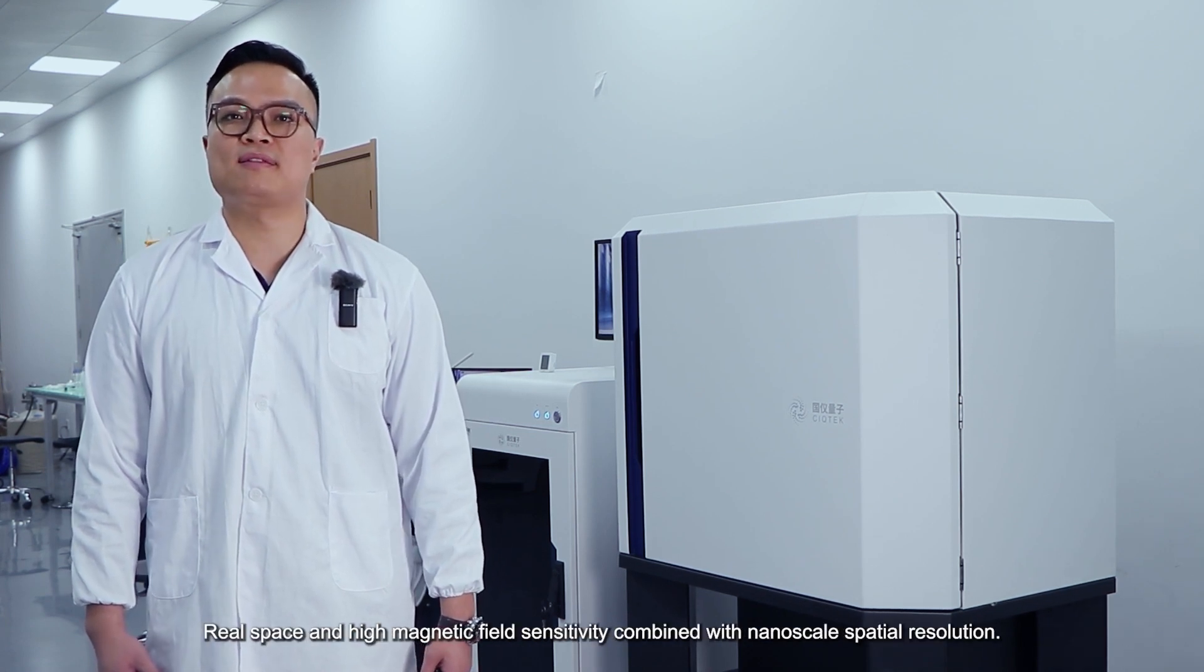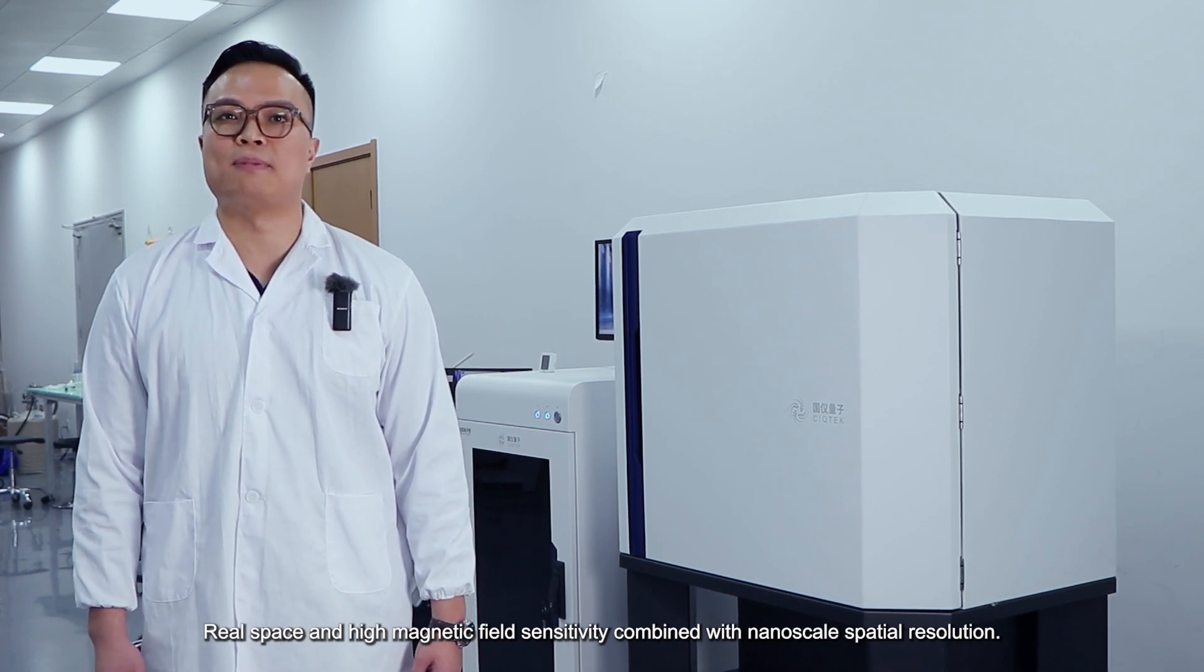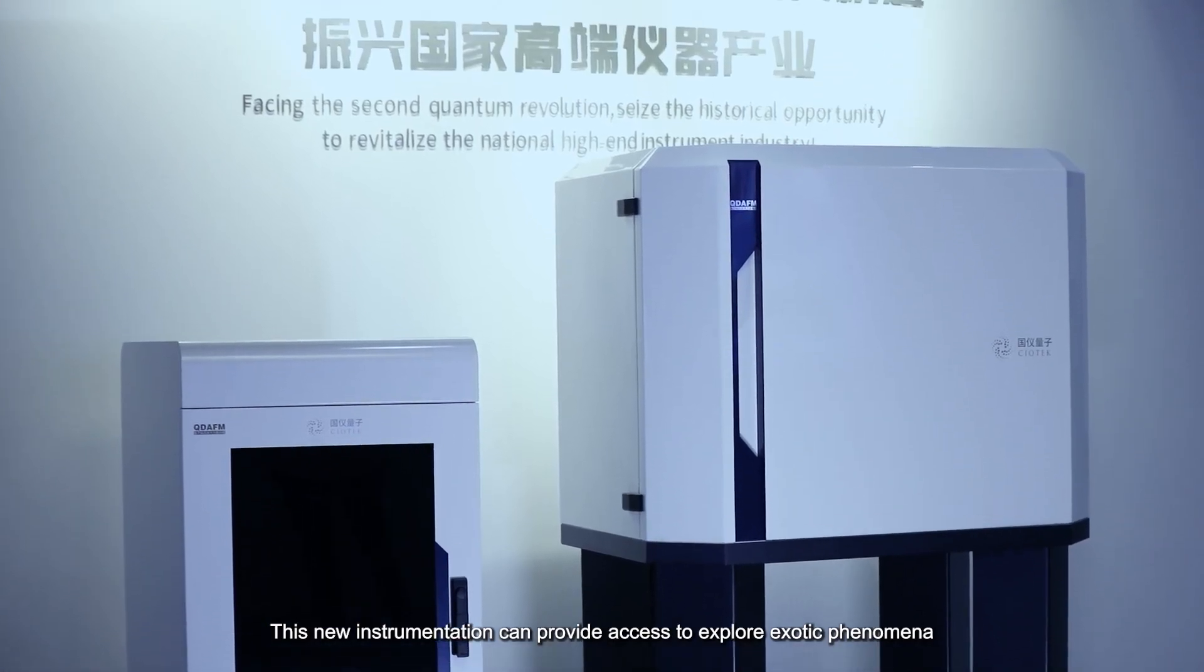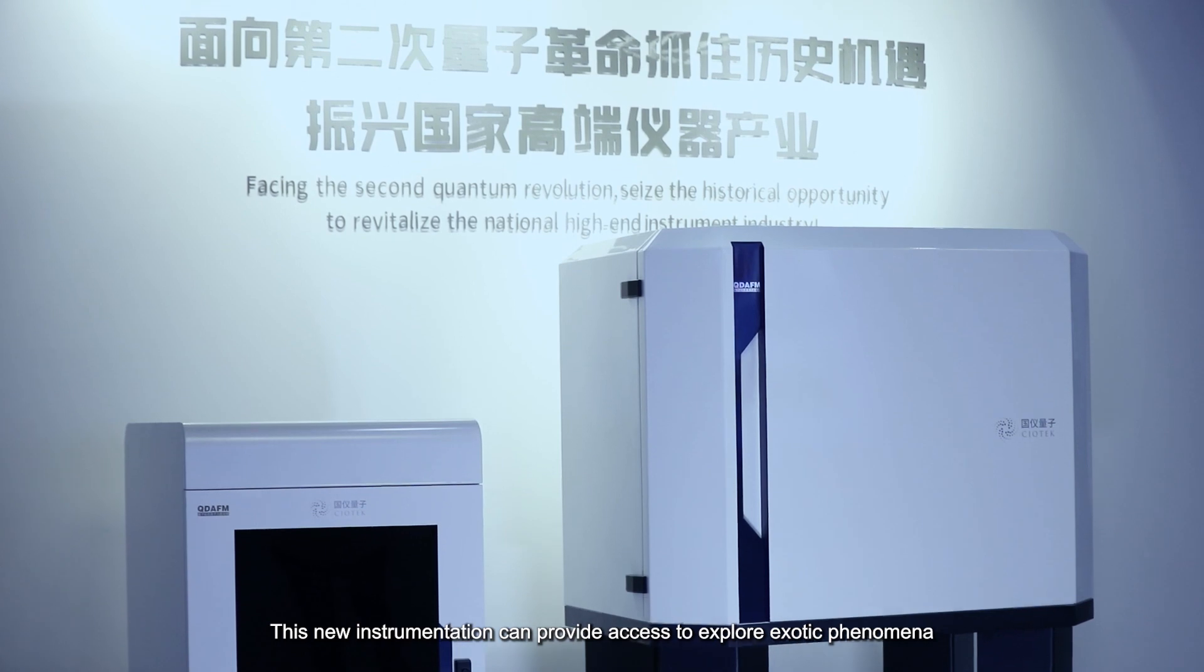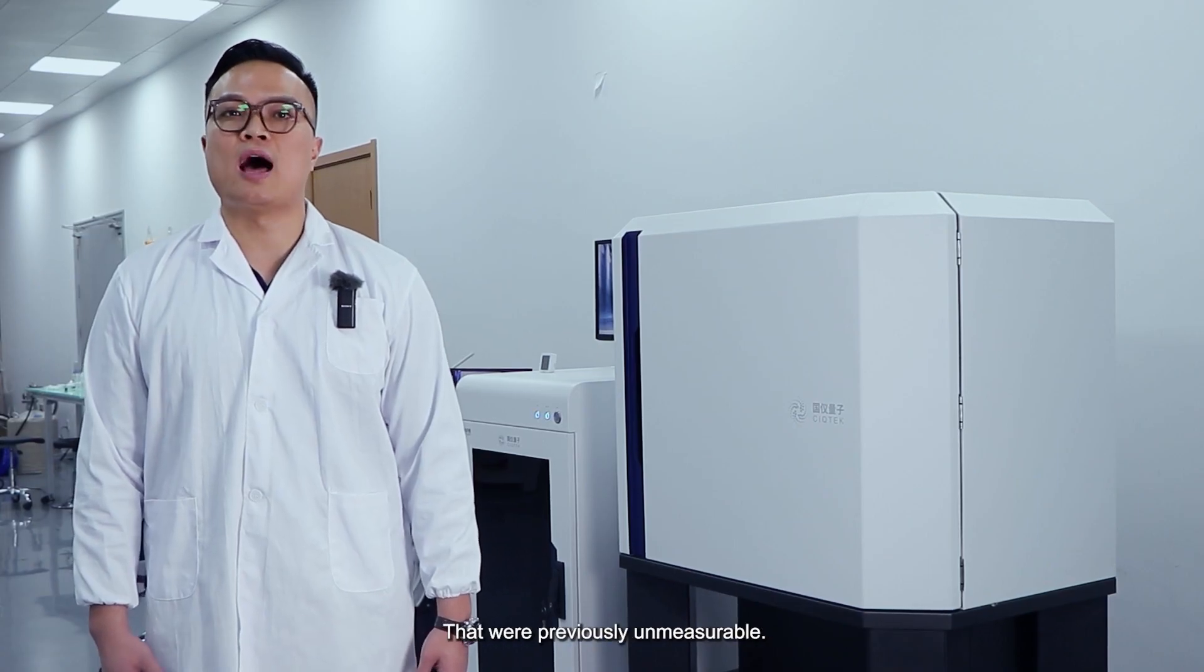Real space and high magnetic field sensitivity combined with the nanoscale spatial resolution. This new instrumentation can provide access to explore exotic phenomena that were previously unmeasurable.